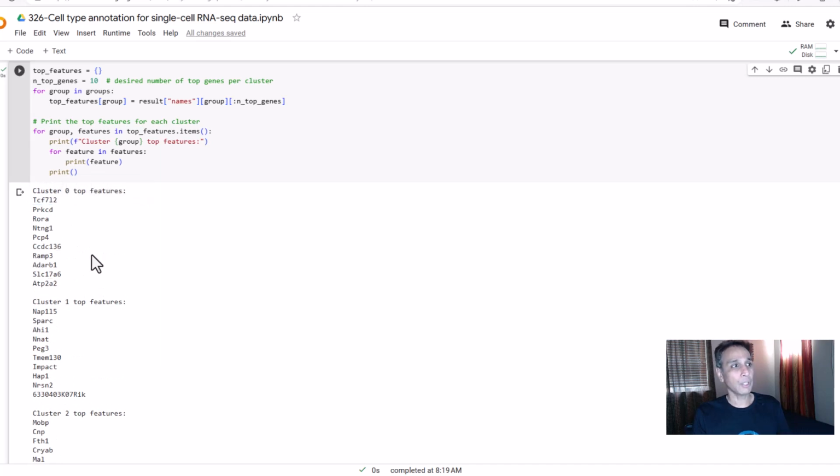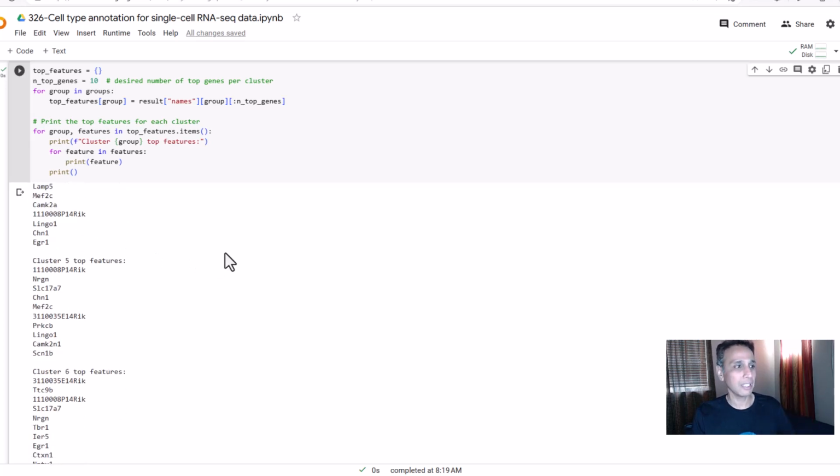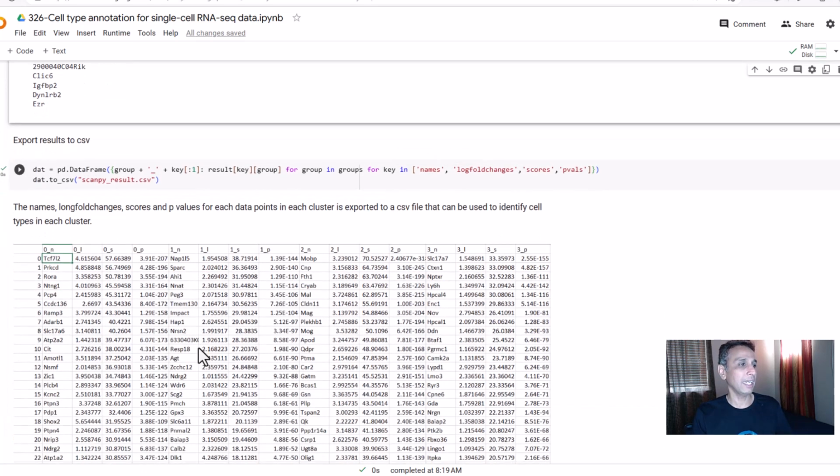Now, if you are smart enough to know that, hey, these are the top 10 genes, so I know what the cell type is, I know what the tissue type is, amazing. But most people are not that way. We need to match these against a certain database. So it gives us probabilities, or some sort of a score, of what it suggests the cell type is for that type of profile. Okay, so that's the goal. So let's go ahead and move down.